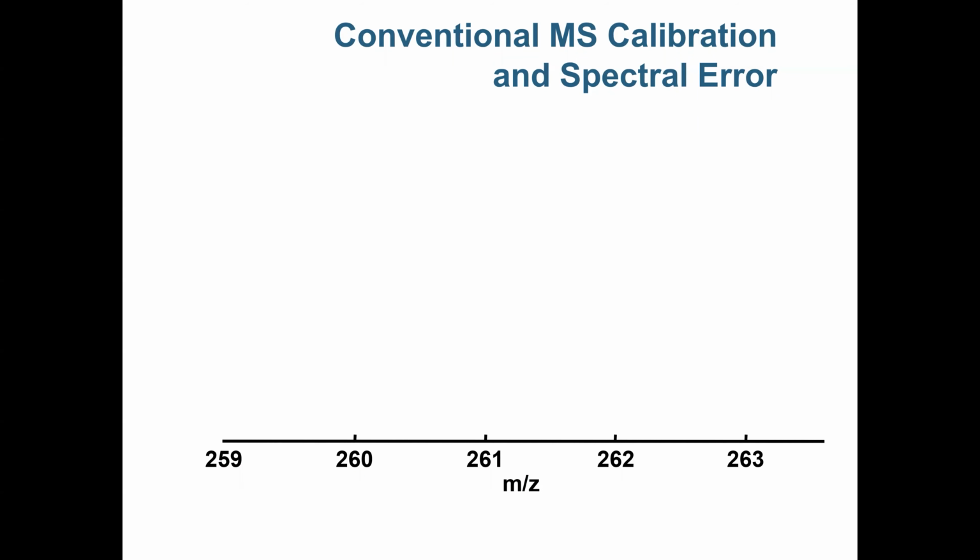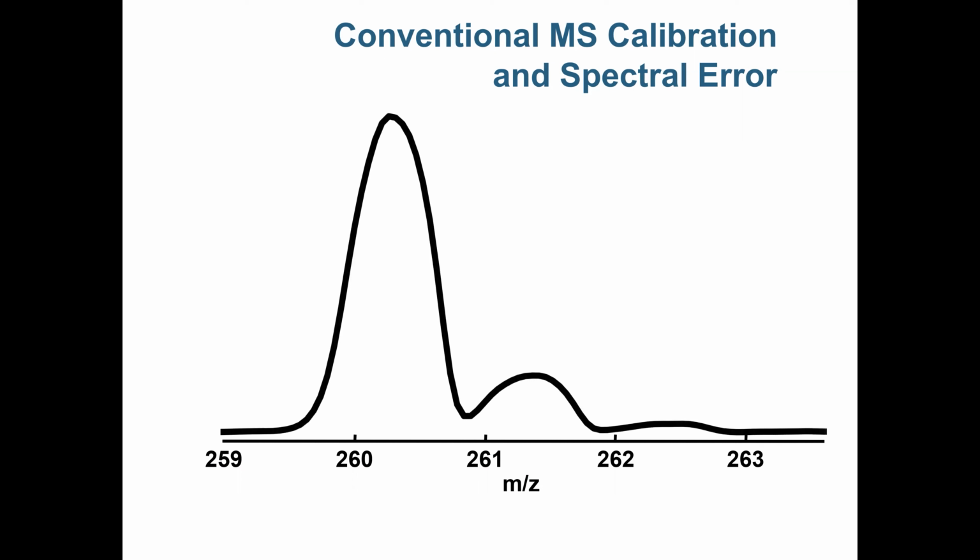It's a little more complicated, but the primary thing that is being done when you run a tune is to basically calibrate the mass axis. It's also the line shape too, but we're not going to get into that detail right now. And this is what your instrument, again, measures. This is the profile mode data. This is always the raw underlying data.